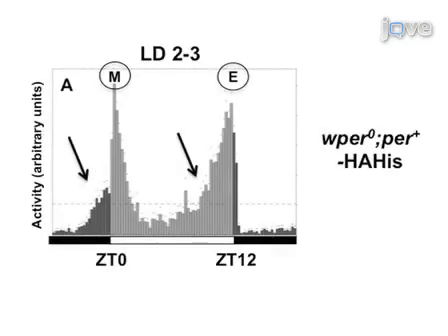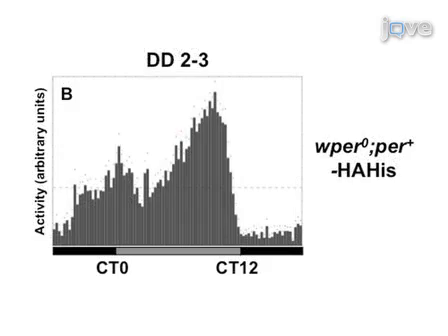Drosophila melanogaster generally exhibit 2 bouts of activity, one centered around ZT0, termed morning peak, and another around ZT12, termed evening peak. These 2 bouts of activities are controlled by the endogenous clock and can be observed even in free-running DD conditions. Changes in the timing of these activity peaks can easily be observed in eduction graphs and may indicate a change in the properties of the endogenous clock.